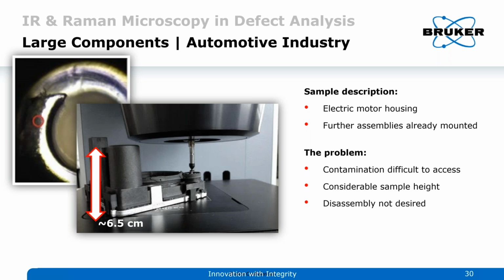And if you look carefully at the image in the center, you can see the ATR crystal is on the end of a stick that's on a piezo drive, and allows you to get into tight areas very nicely. So you can analyze large objects with very high resolution, but also with what I would consider high dexterity of analysis and being able to get in there. So in this case, you didn't have to do any disassembly or destruction of the part to do the analysis.